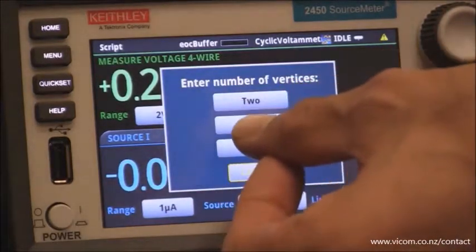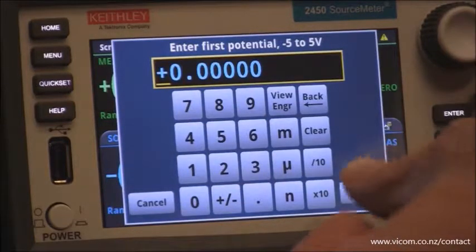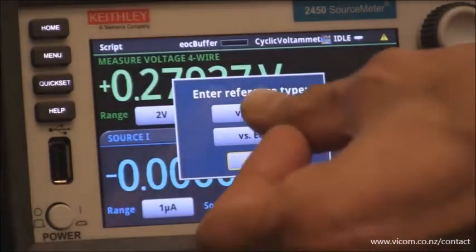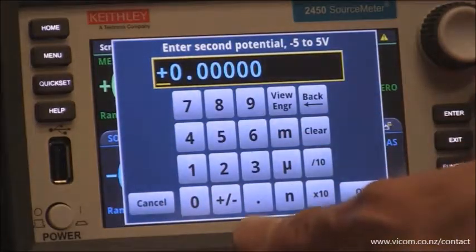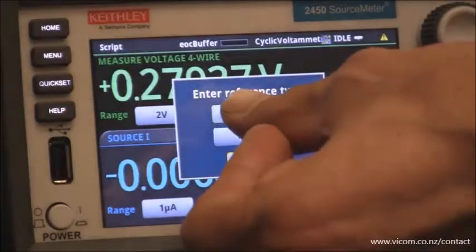The number of vertices that we want here is 3. The first potential, we're going to select 0 versus the reference. For the second potential, we're going to select 0.6 for this chemistry, again versus the reference.